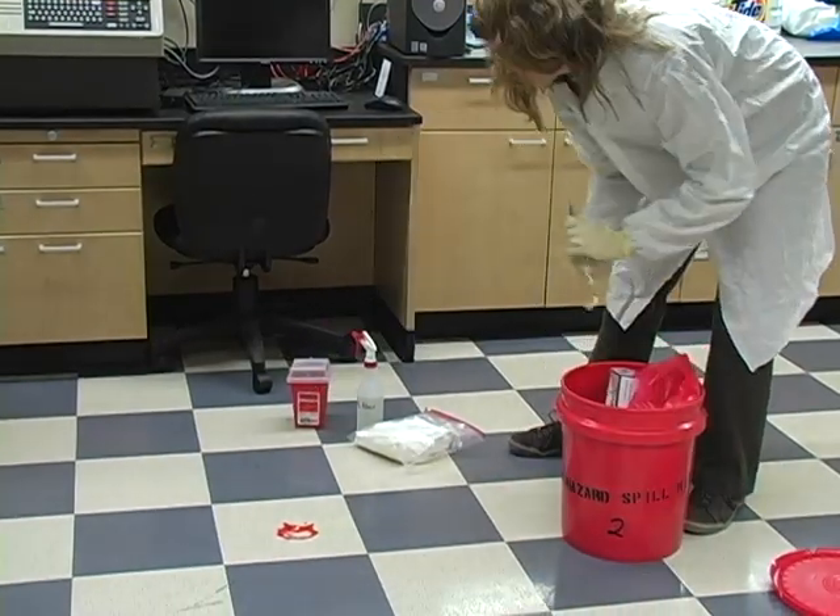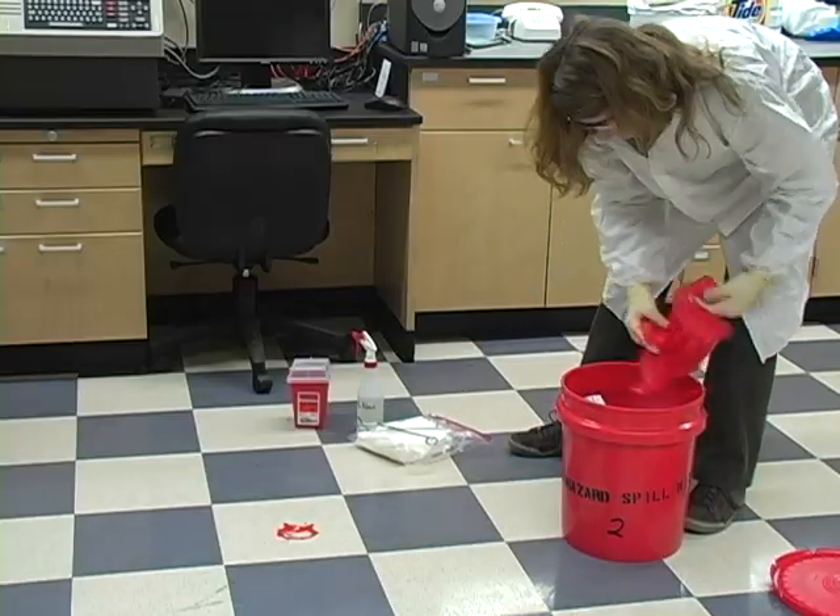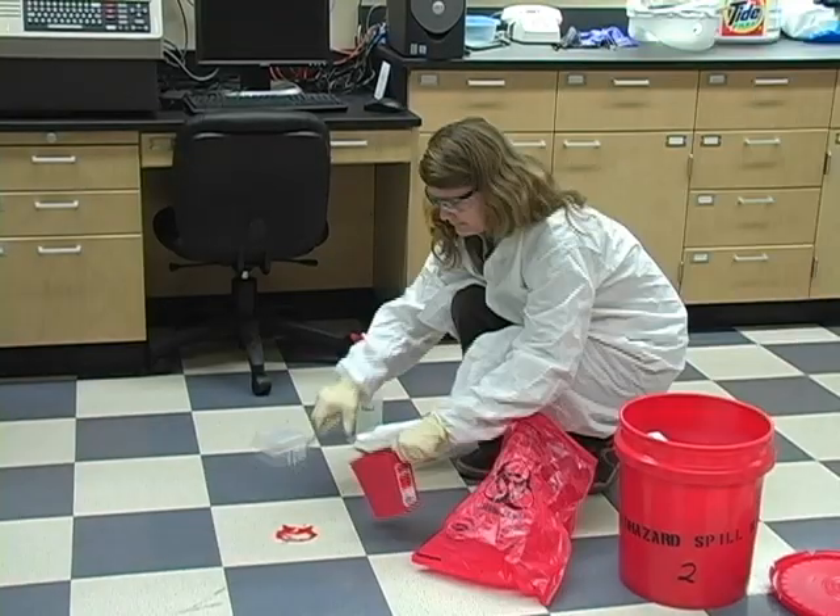If there's a lot of blood, remember that more spilled material equals more splatter, so use additional protection if needed, including disposable overalls, booties, or face shields.